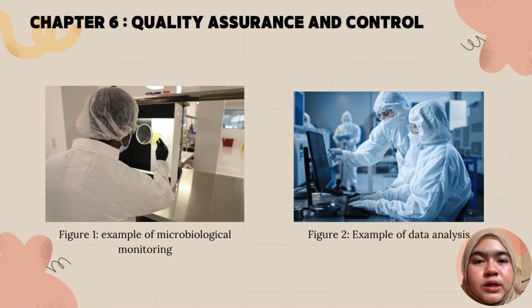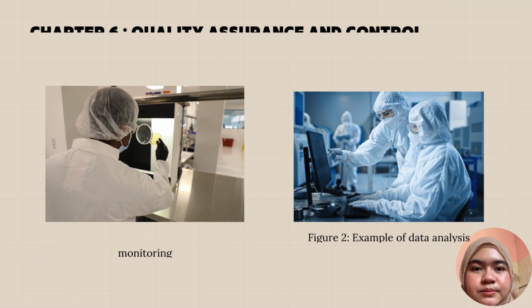The first picture shows an example of microbiological monitoring, and the second picture shows an example of trend analysis to check the data over time and the trend of rising contamination and correct it before major product failure.